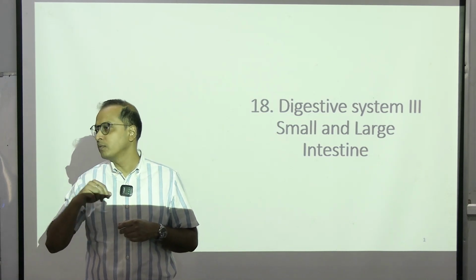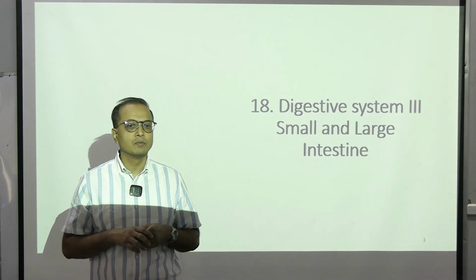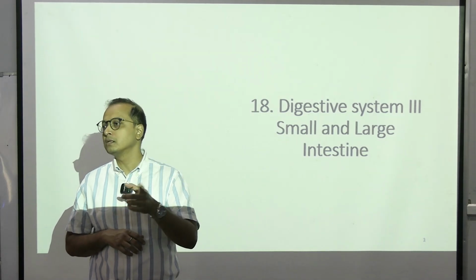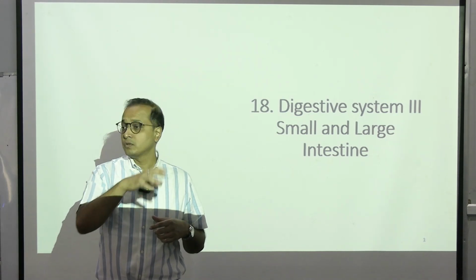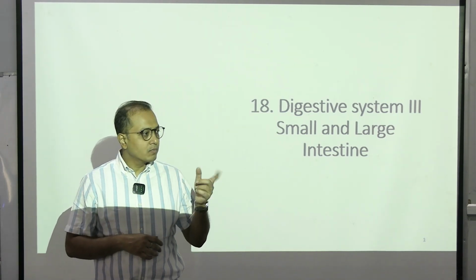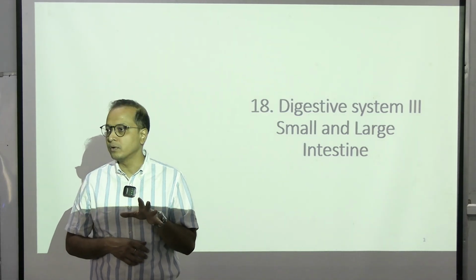To increase that absorptive surface area, the mucosa has gone into duplication as mucosal folds. These mucosal folds look like finger projections; we call them villi, or intestinal villi, which are duplications of the mucosa. This is a hallmark of the small intestine: it is present only in this particular region, no other place has it.